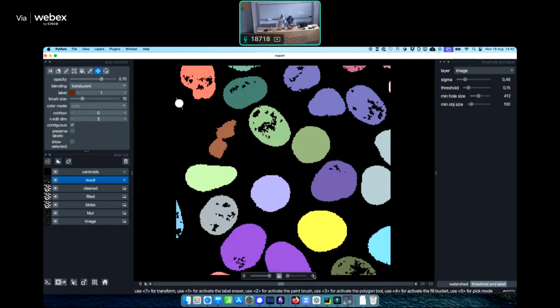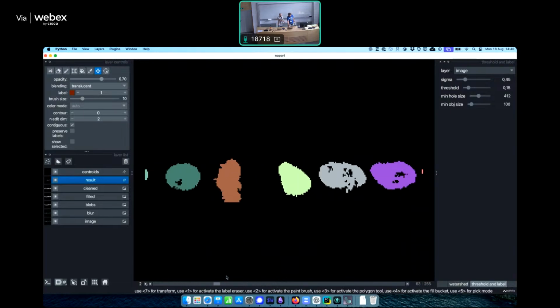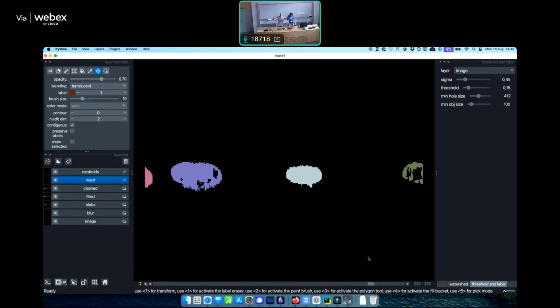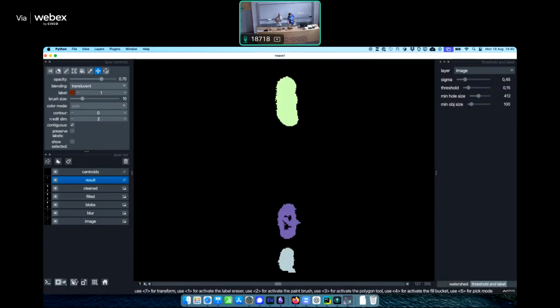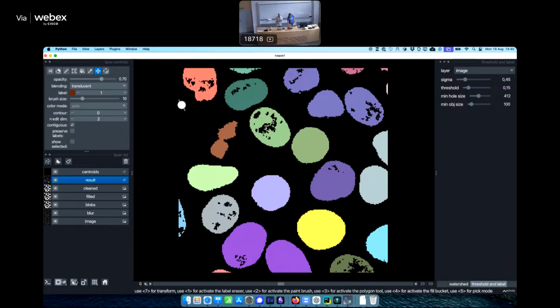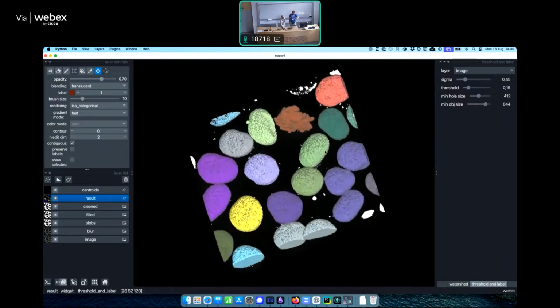Also, one thing that you can look up now maybe is transposing the dimensions, and we can look at them in other orientation. So you see now that at the bottom left of that slider it says 2, because now we're slicing through the second dimension instead of the 0th dimension, because we transposed. So we're moving along like this, then you change it again, and now we're moving along like this. And going back to how we were. And you can also, of course, just simply switch to 3D and still do the same stuff while you're in 3D. And just remove small objects.